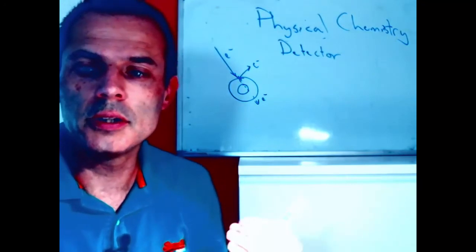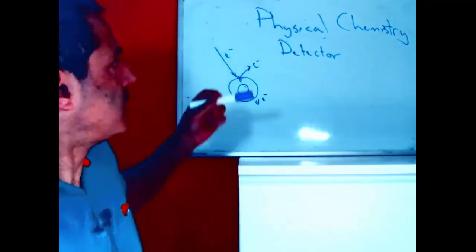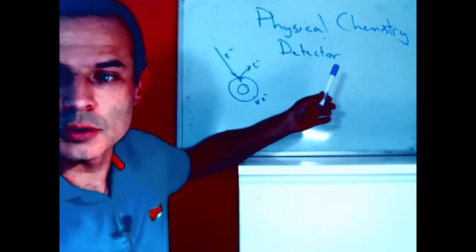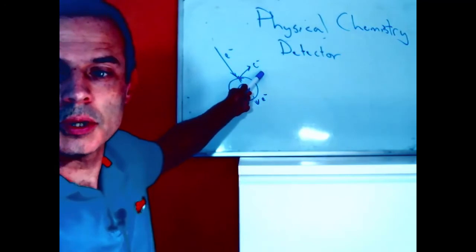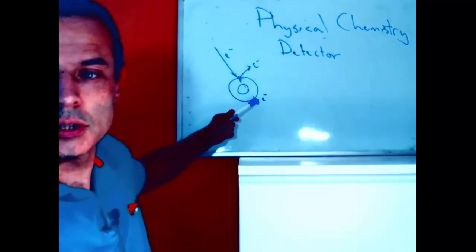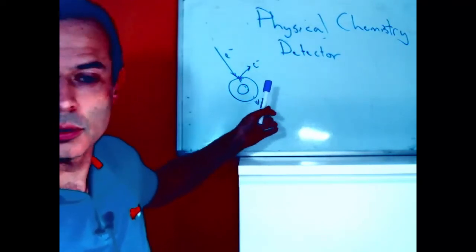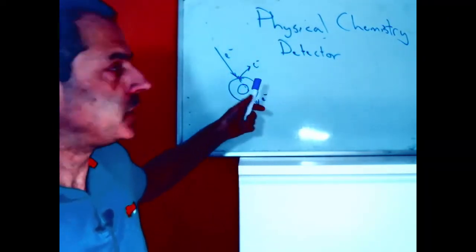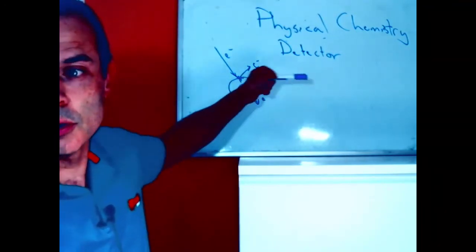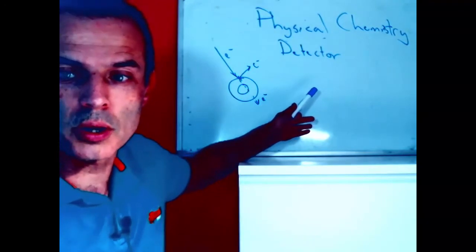We have already seen the fundamental principle of our electron detector, that if we hit an atom, a reasonably heavy atom, with an electron, we can shoot out an electron from it, but the electron that we shot in carries on. So if we set up suitable optics, electron optics, we can make the two electrons go to our detector, so effectively we've generated a multiplier.